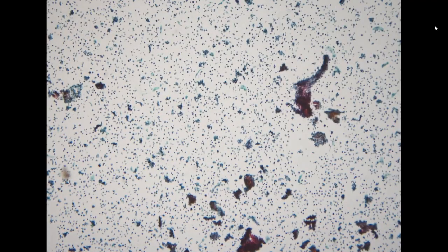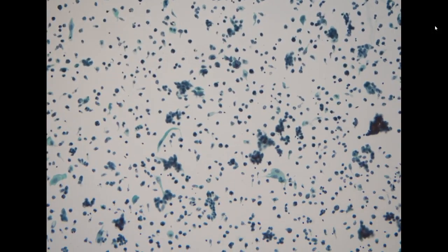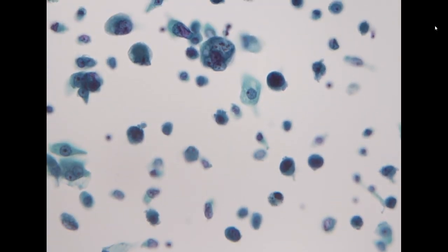So the next specimen is a urine cytology from renal pelvis. Again, we have a very hypercellular specimen because it's a washing specimen. It's supposed to have a lot of cells. And in this specimen, it is very obvious that most of the cells are hyperchromatic. And some of the cells show more degenerative features. But the others, you can see, are well preserved.